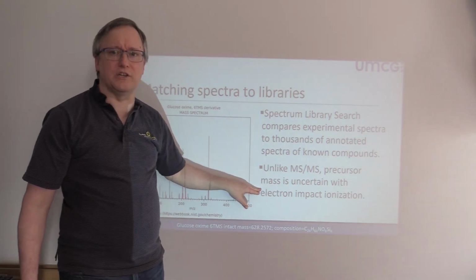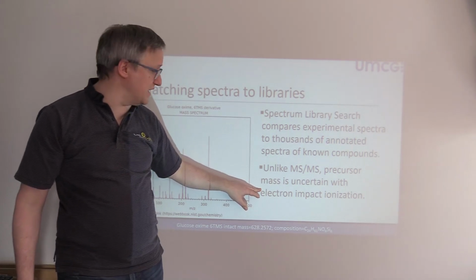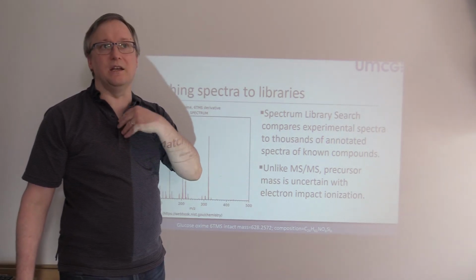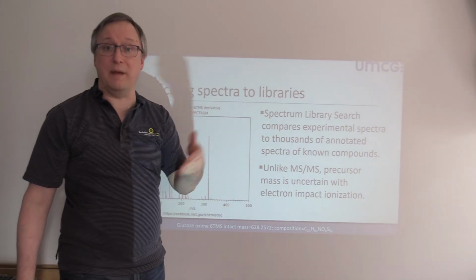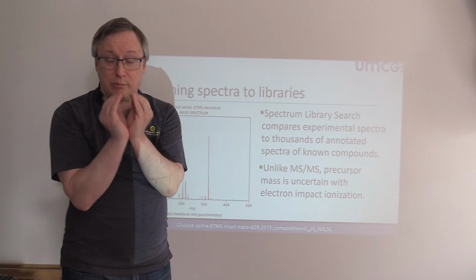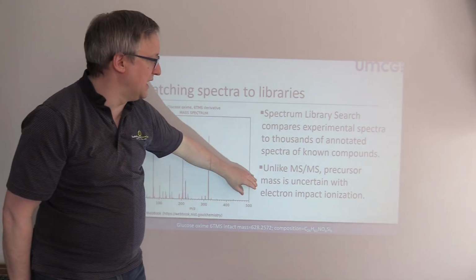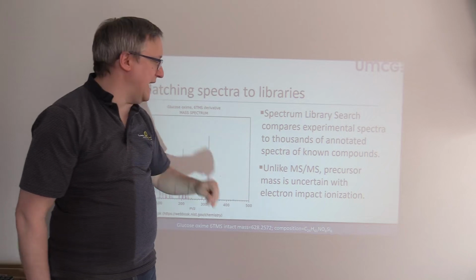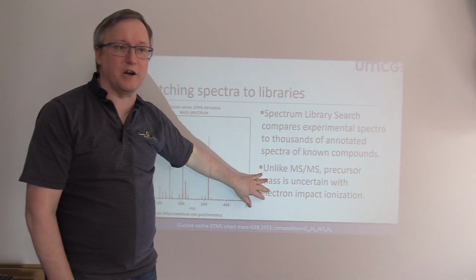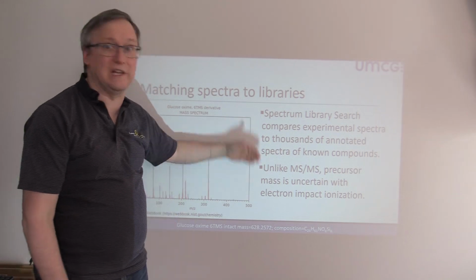There's a bit of a challenge, however, that makes this rather different than spectral library searching in proteomics. In LC-MS of peptides, we have isolated ions of a particular precursor mass to charge value and then fragmented them. In this case, however, we have generated our mass spectrum via GCMS with electron impact.